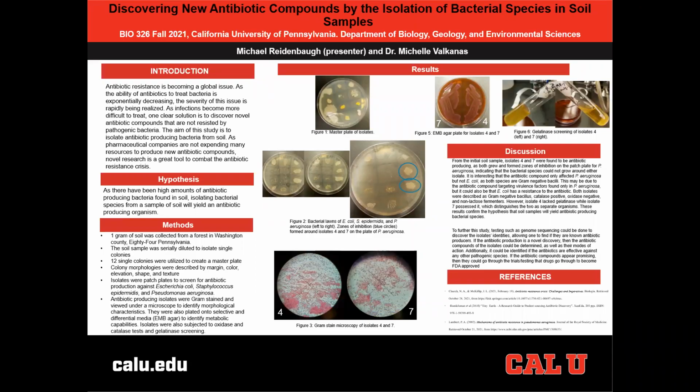Hello, my name is Michael Reidenbaugh, and today I'm going to be presenting on research that I performed in my microbiology course. The goal of this research was to find bacteria in soil that is able to produce undiscovered antibiotics.